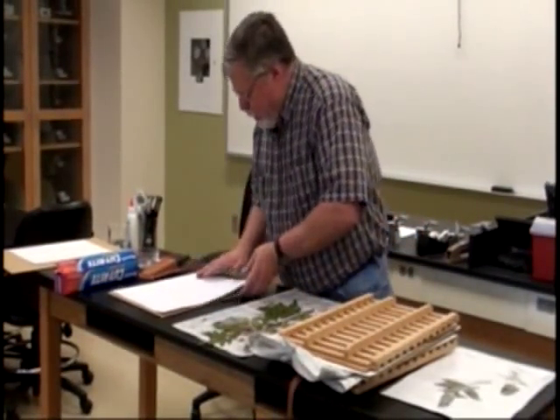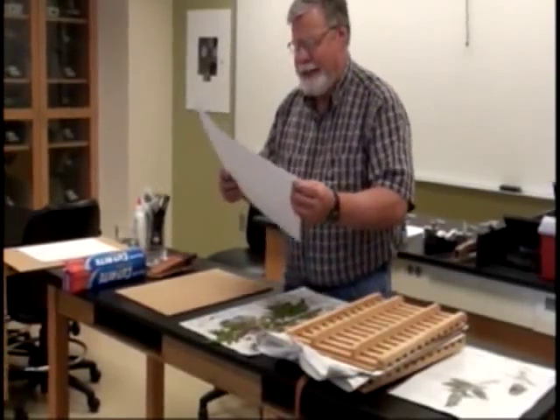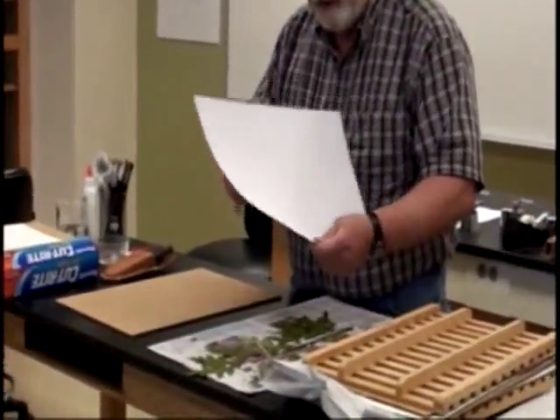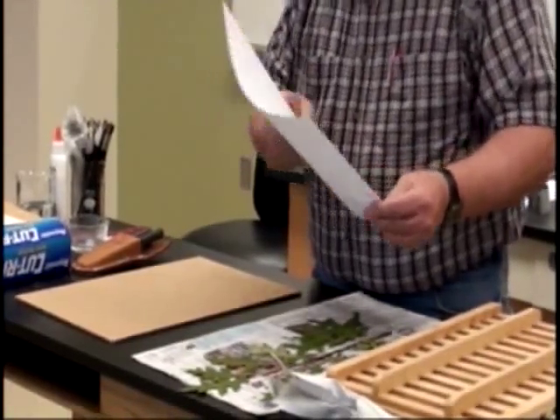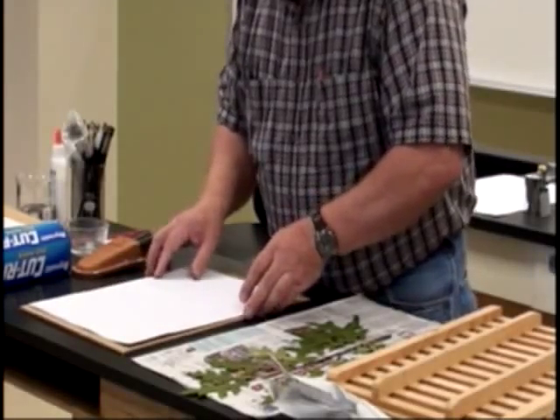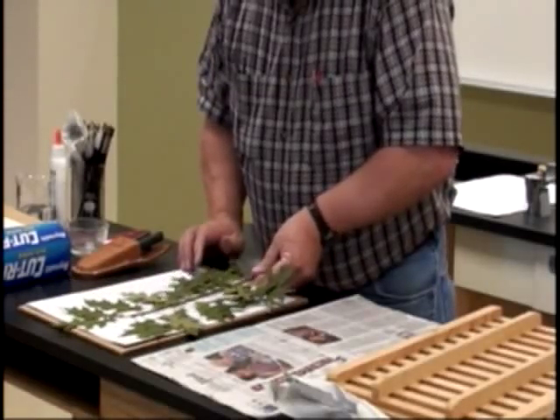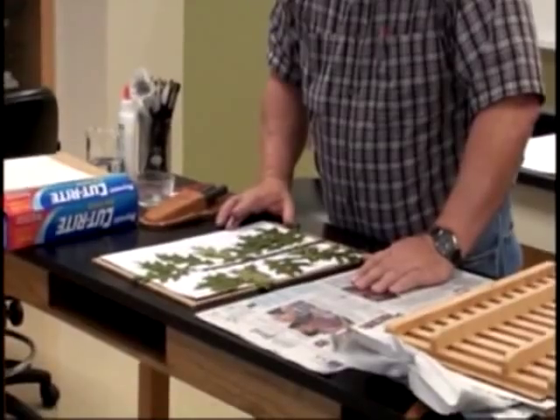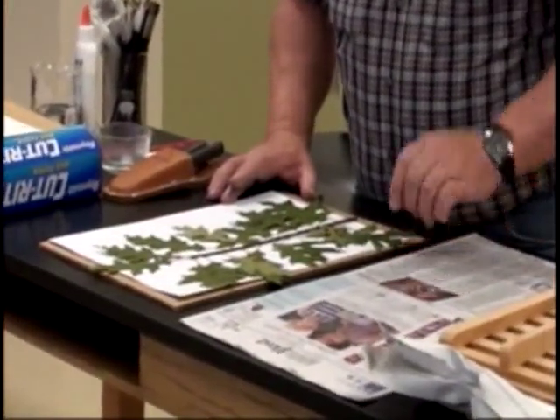What I have here is a piece of herbarium paper. It is acid-free. We purchased this from a biological supply house. It's approximately 17 by 11 inches in size. We're going to take the plant and place it on the sheet to see the size characteristics of it. You can see right now that it's a little bit too big, so I'm going to have to trim it down a little bit.